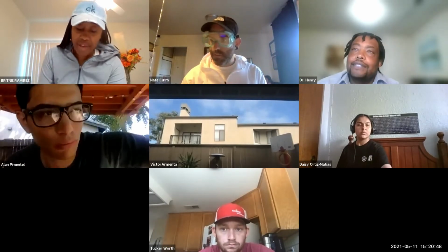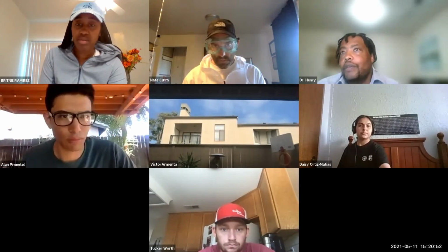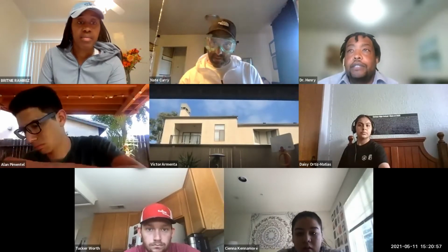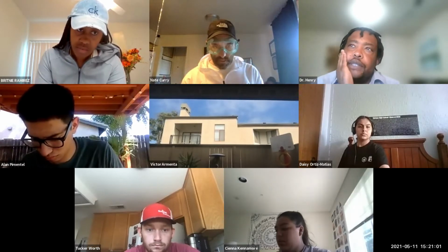But that's interesting. If you don't have an exact scale to weigh this, about what would that be, 2 grams? Yours says exactly 2 grams. So a half teaspoon is about 2.5 grams.